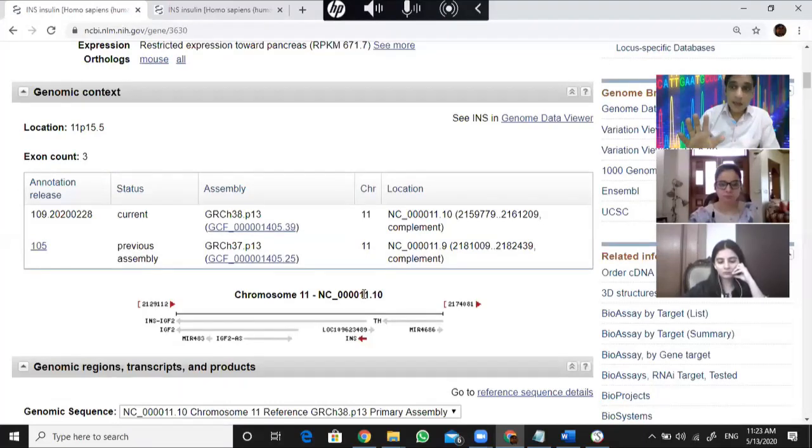You can study the genome browser from NCBI as well. This is the genome browser of NCBI, but I will be teaching you the genome browser organized by UCSC. That is easier to deal with. Okay, so this is my experience. Based on my experience, I know which portal makes getting a particular piece of information easier. The gene information is much easier to get from NCBI, but genomic information about the genes and locations is much easier from the UCSC genome browser. But that does not mean NCBI is not good. It's also good. For some people, it might be easier.